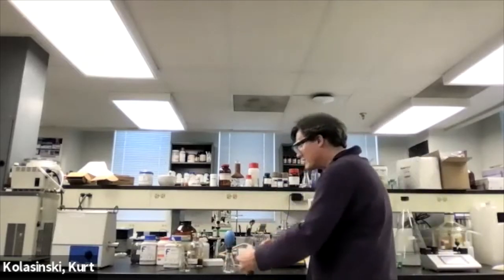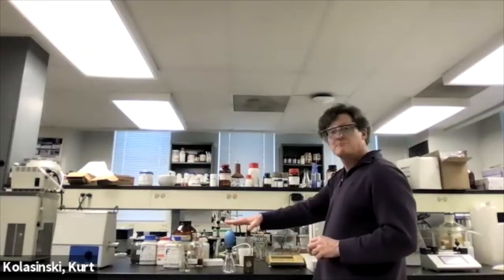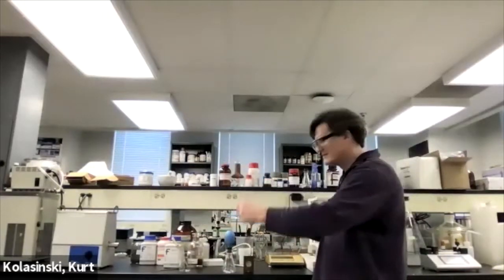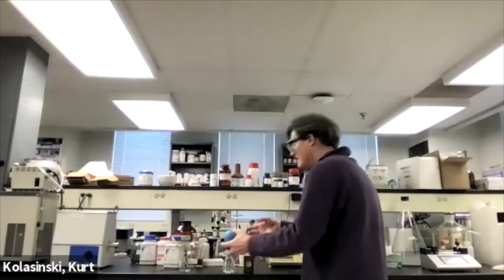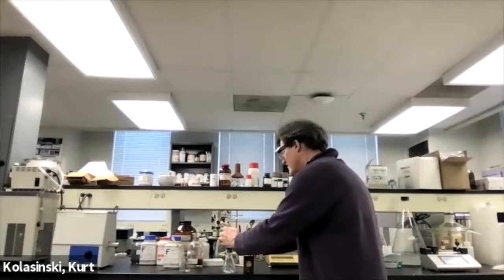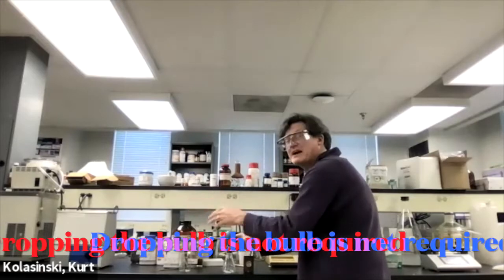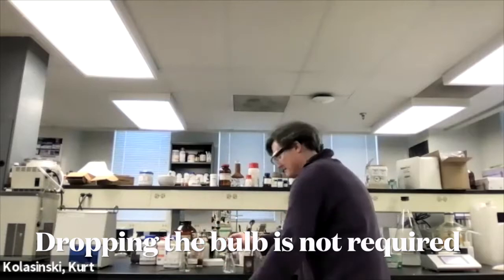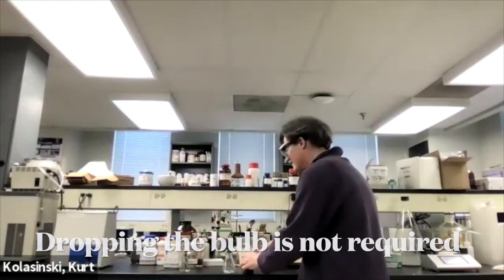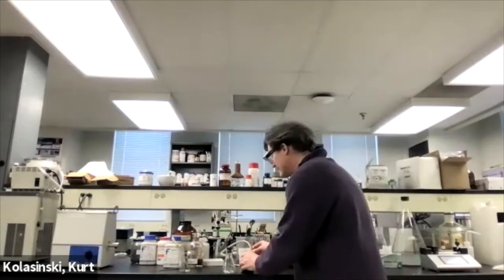Now we have that bubbling going on. HCl is forming, right? And we've got a pipette ball, and we're going to use that to waft the gas from here into our cells. So we open up these two, we build up the pressure there, right? And we go waft. Now take it off, open it back up, because if you suck back out all the air, it's not a very good idea. Waft again, right? And now we can close off the valves, boom, and we should have HCl in here.